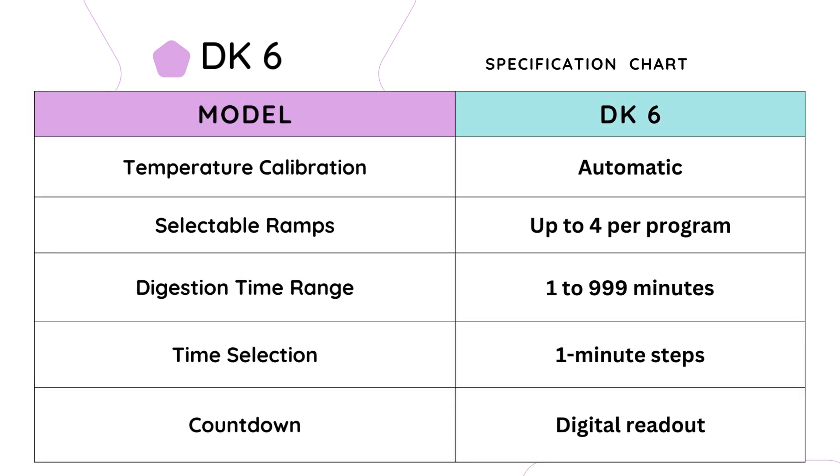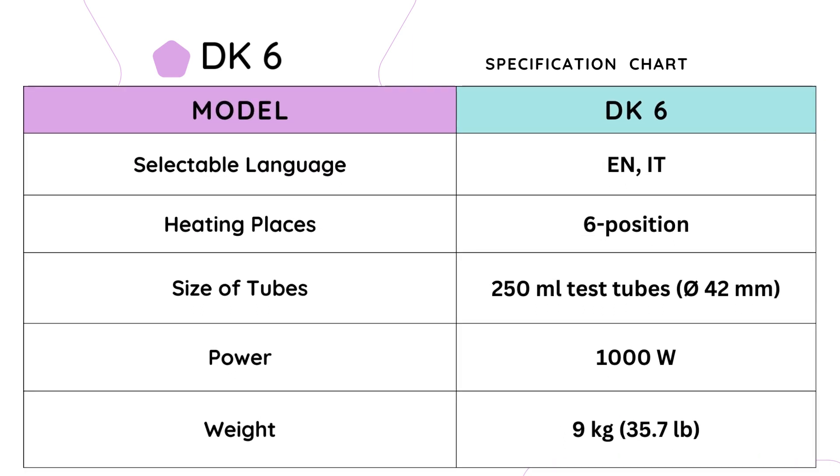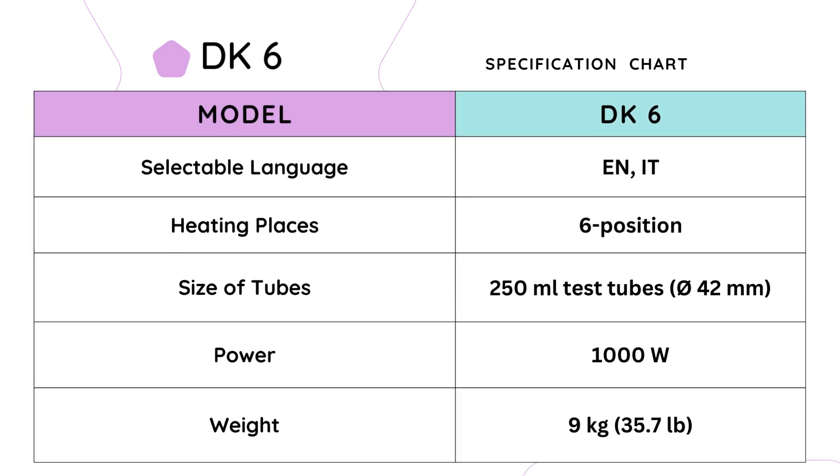With the DK6, you have the flexibility to program up to four selectable ramps, providing controlled heating profiles tailored to your specific needs. The digestion time range spans from 1 to 999 minutes, selectable in one-minute increments. The countdown feature provides a digital readout. You can choose between English and Italian as selectable languages. The DK6 offers six heating places for 250 ml test tubes with a diameter of 42 mm, with a powerful 1000 W heating capacity. It weighs just 9 kg, with compact dimensions of 220 × 140 × 350 mm.